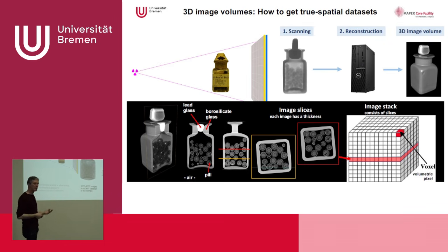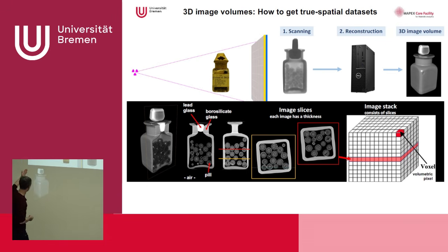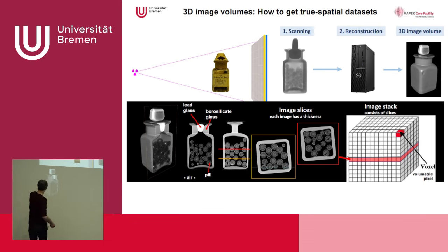And what we do now basically with our data analysis is that we inspect these kind of volume data sets with some software. What is a volume data set? You can perform some kind of virtual thin sectioning. Then you can open it. You look inside, you see this kind of pills. There is some organic material, of course, that had to be eaten by the sailors, maybe against seasickness or so. And this is presented here in a glass bottle.